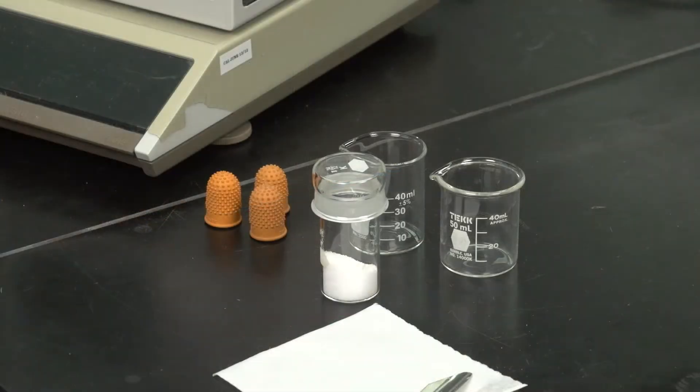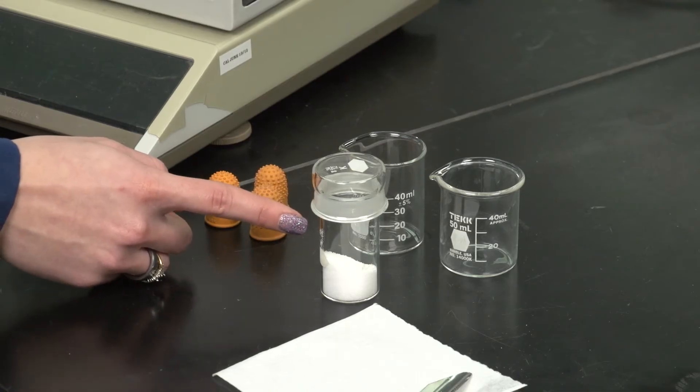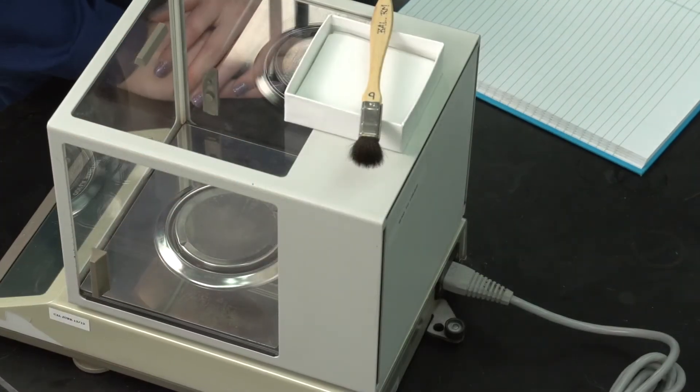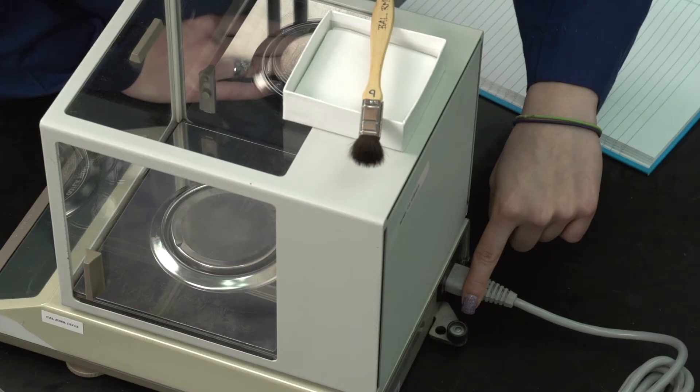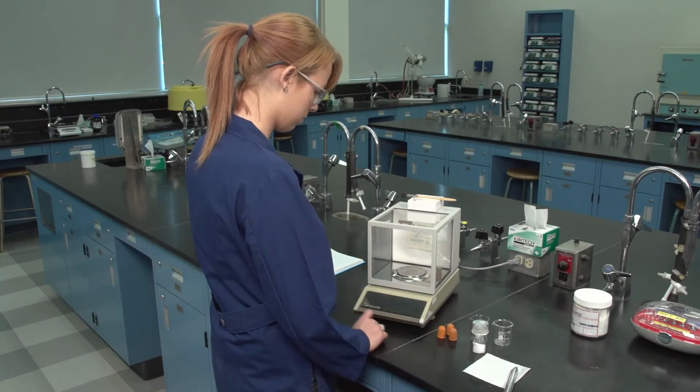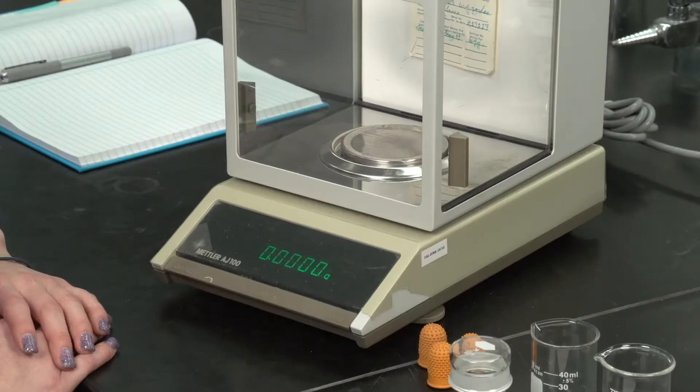Obtain an amount of material that is slightly greater than the mass of sample required. The sample should be placed into a clean, dry, weighing bottle with lid. Prior to use, ensure that the analytical balance is both clean and level. Turn on the balance. Press the tare bar and wait until a stable zero reading is obtained.